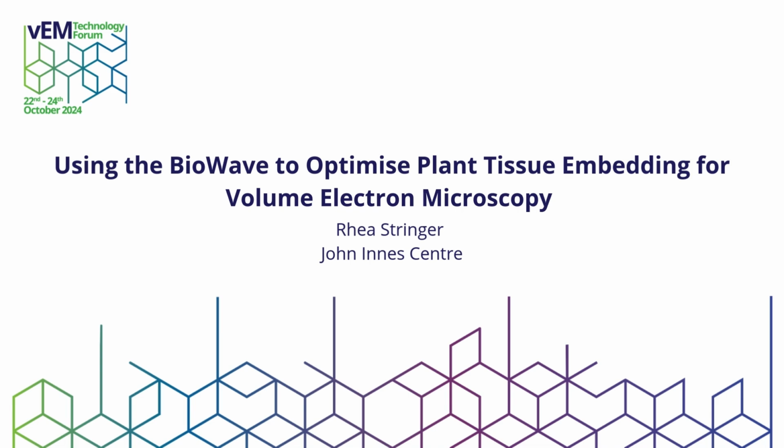I wonder, have you explored the use of vacuum? Because in the BioWave, you can have different modes, like vacuum on, off, or switch it. Yeah, the vacuum, essentially we have it set on auto, which means it's kind of always on. I believe the vacuum doesn't come on for maybe the dehydration steps, but definitely for the fixation and for the staining steps, the vacuum is present.